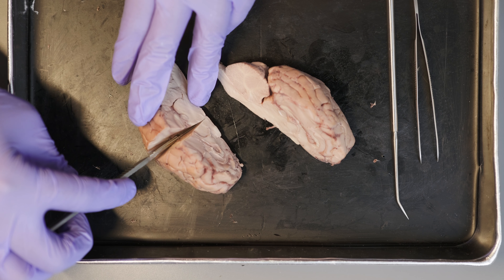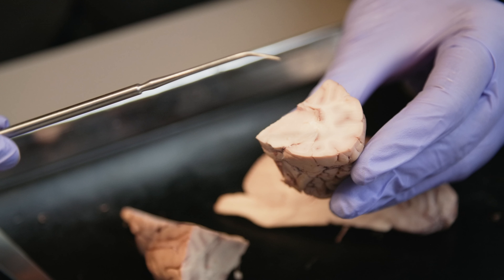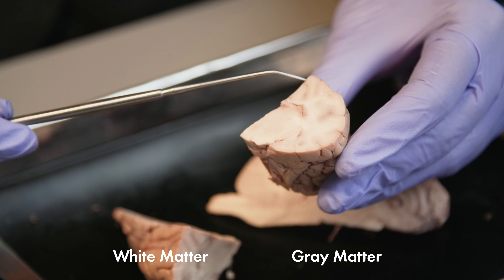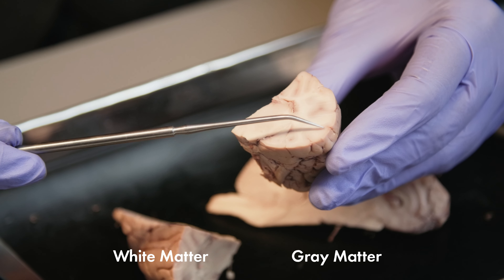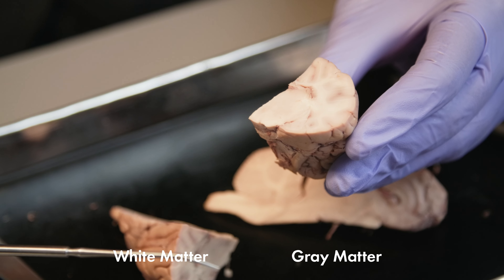Now I'm going to make a cross section through one cerebral hemisphere just anterior to the thalamus. Here we can see the inner white matter and outer gray matter. The white matter contains all the nerve fibers in the brain that connect different areas of the brain to each other and to the spinal cord, practically working like highways. The color is white because the nerve fibers are covered in a protective sheath called myelin. The gray matter contains lots of nerve cells which allow it to process and relay information through the signals found in the white matter.